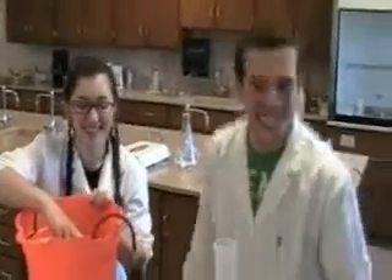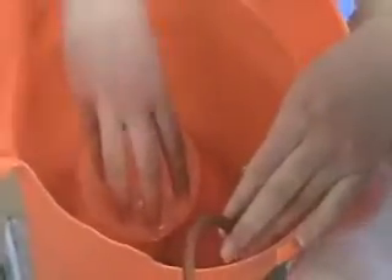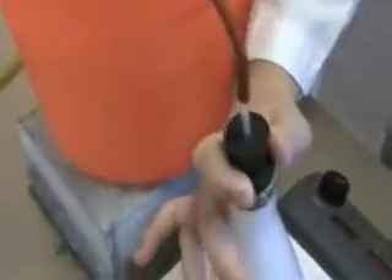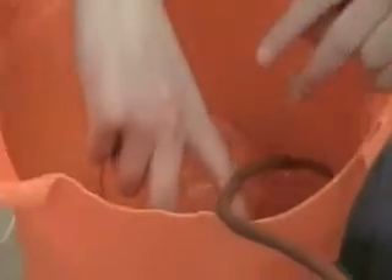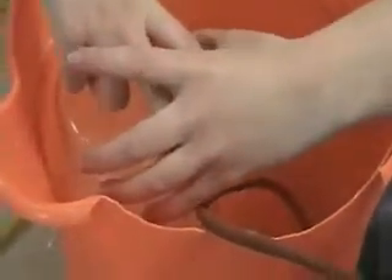You guys ready? All right — it's not even breaking up into individual bubbles yet. Oh my God, guys. Look at it — it's pretty much spitting bubbles. It's still going! Let's lift that beaker up and see the volume you got out of it — whoa! Almost blew it out. Oh, wow!